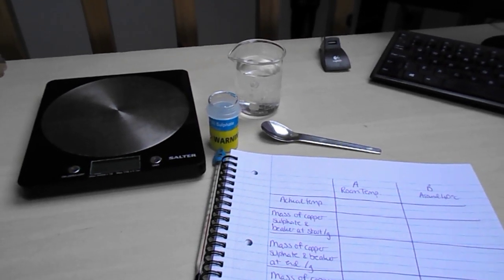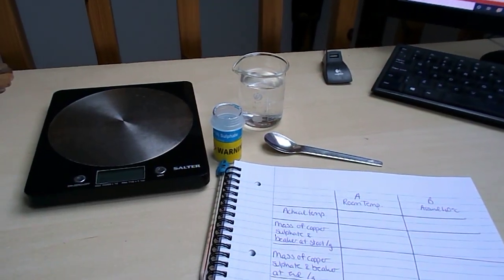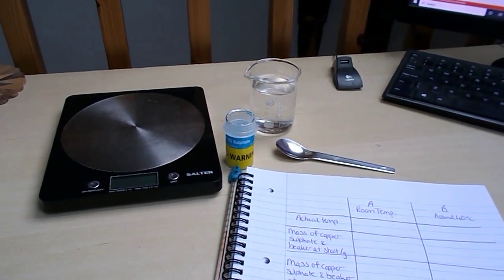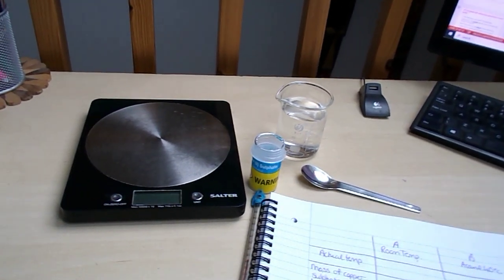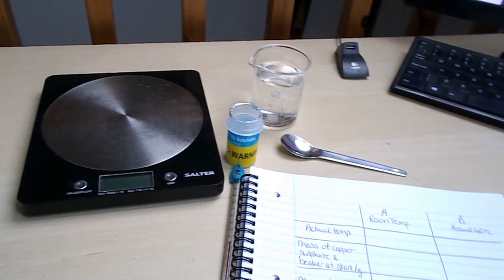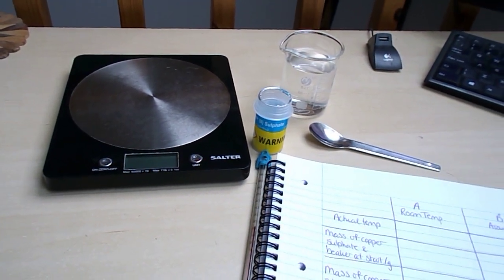Now you've read through the methods, I'm going to give you a quick demonstration of what this experiment would actually look like. I'm not going to go all the way through to the end because I'm using the copper sulphate in my daughter's chemistry set, and she might not be very impressed if I use all of it up, but we'll certainly get the general idea of what's going to happen.